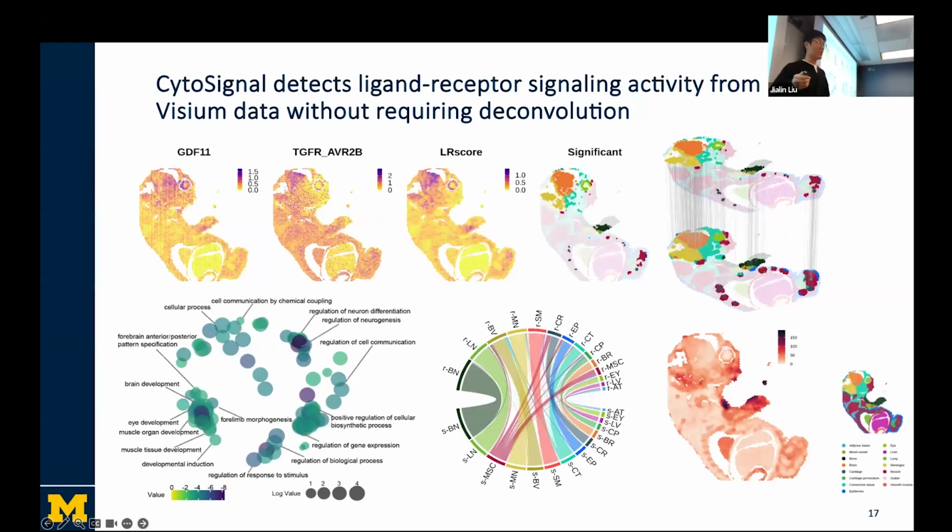So finally, one important feature of any computational tool is its adaptability. Even if in the paper you show you could use your algorithm on one data set, there will always be other researchers who come and ask, okay, can we use your algorithm on maybe ten other kinds of data sets? And CytoSignal has the really good advantage that it's almost compatible with every spatial transcriptomic technique on the market right now.